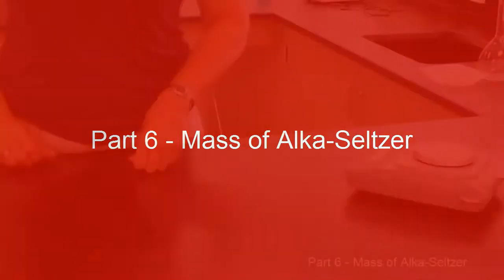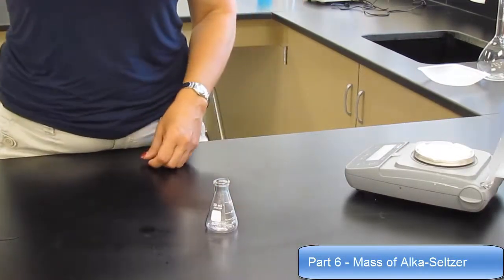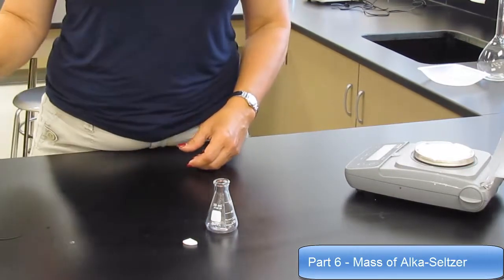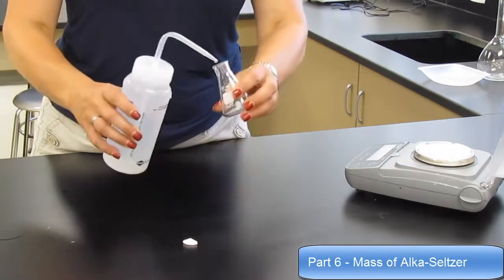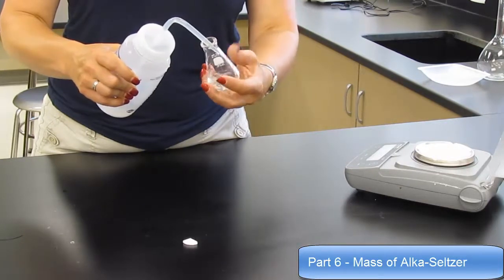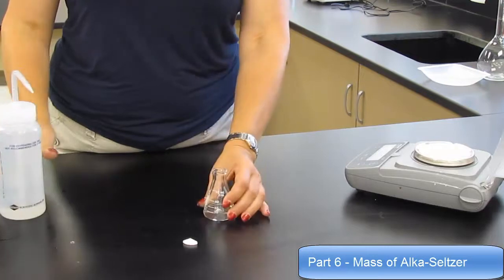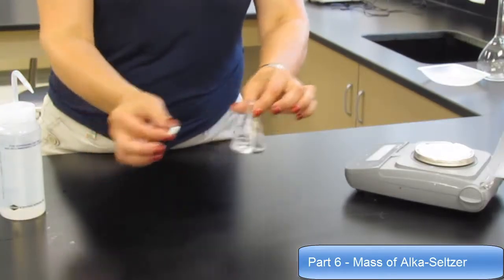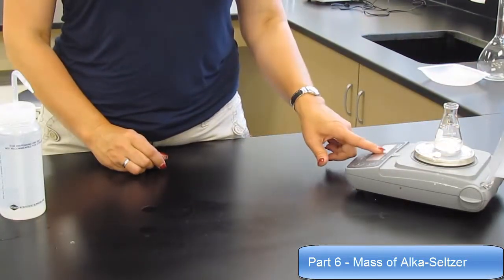Part 6, mass of Alka-Seltzer. For this, you're going to need a small Erlenmeyer flask. You're going to need a small piece of Alka-Seltzer and once again some water. Put approximately 20 milliliters of water into your Erlenmeyer flask. It doesn't need to be perfect. Then take the Erlenmeyer flask with the water and the Alka-Seltzer and put it onto the balance. Take a reading.